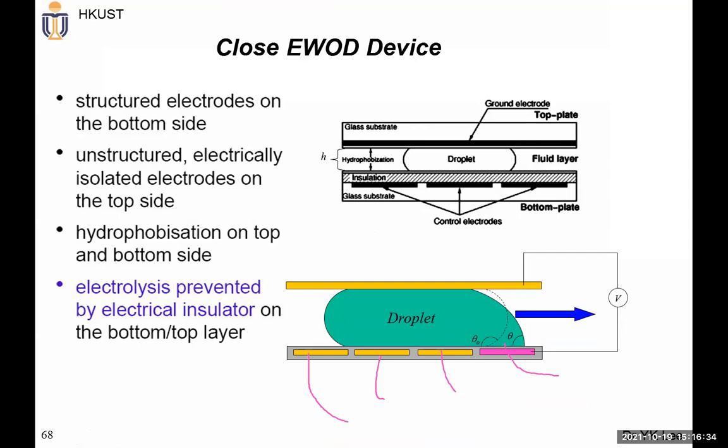Why is that important? If you want to use electrowetting for practical biomedical analysis of biological samples, for COVID-19, or for cell suspensions of blood, you need a way to manipulate the droplet for different things, for example mixing, splitting, and additional processing. This is an electrowetting-based microfluidic device.